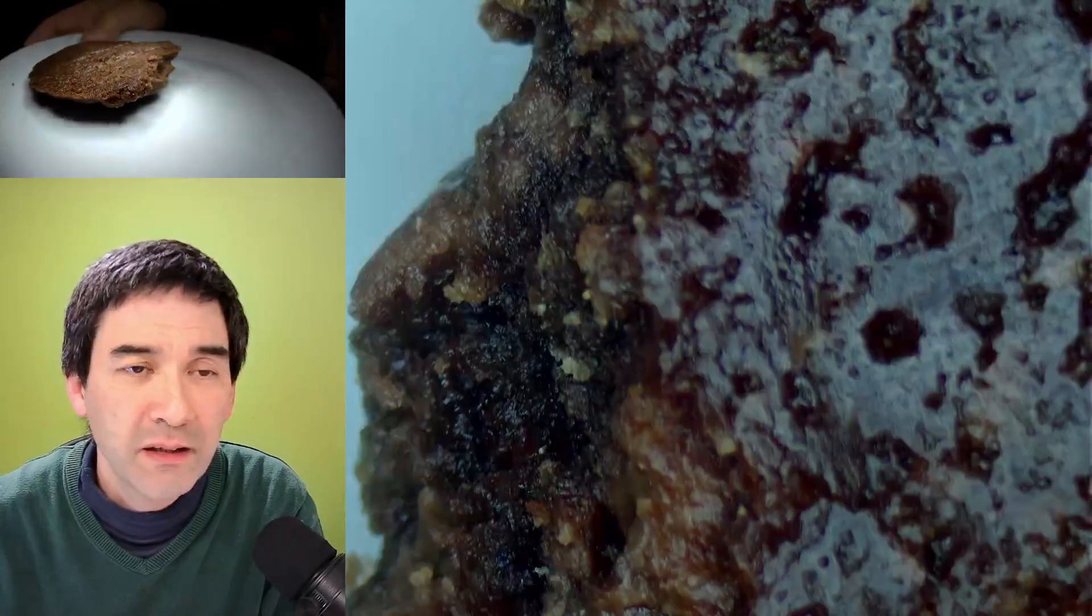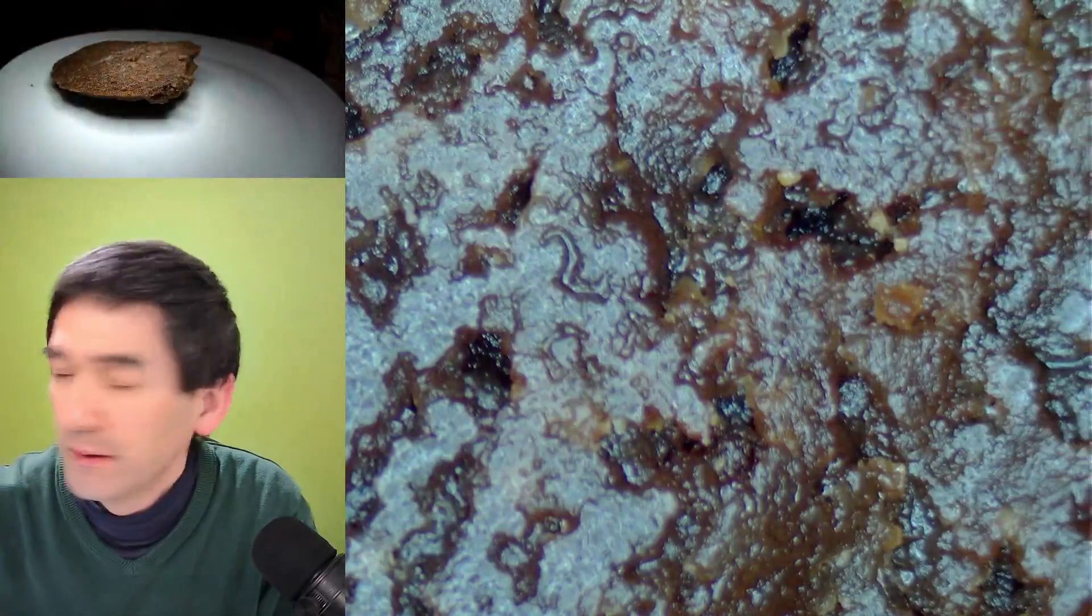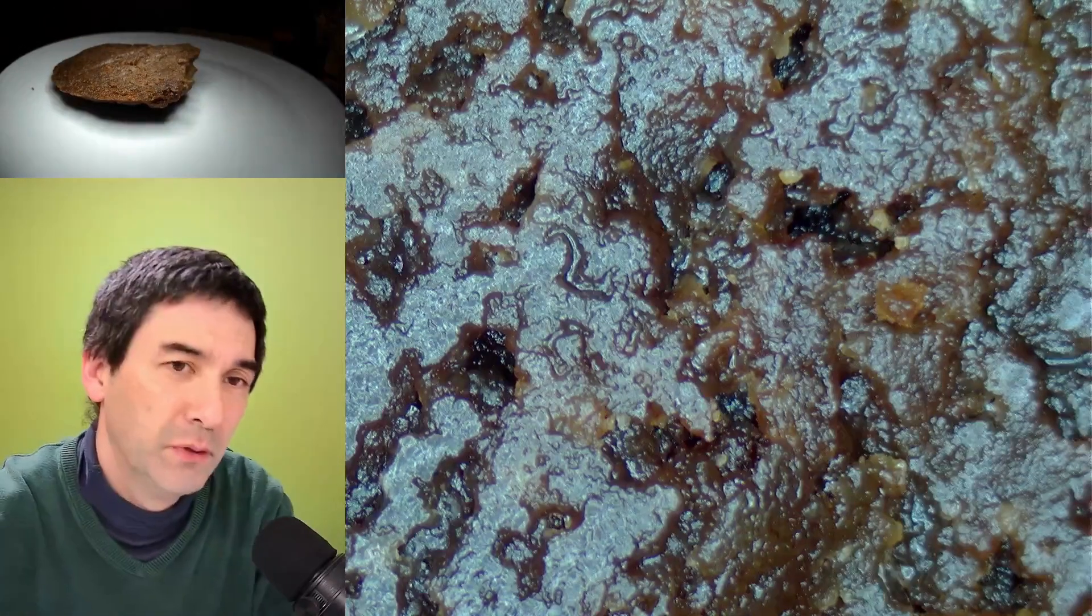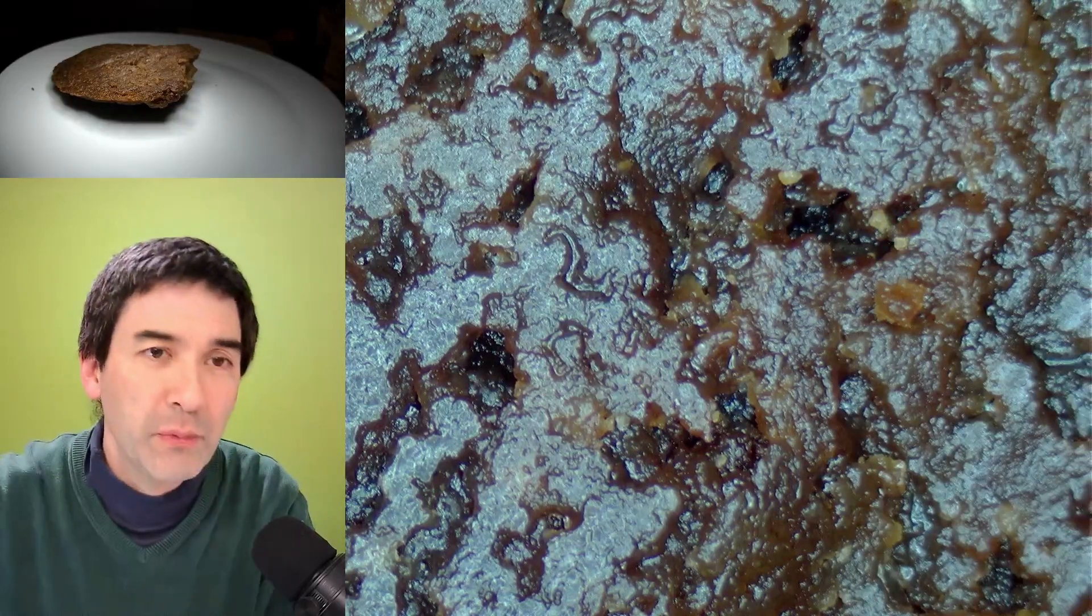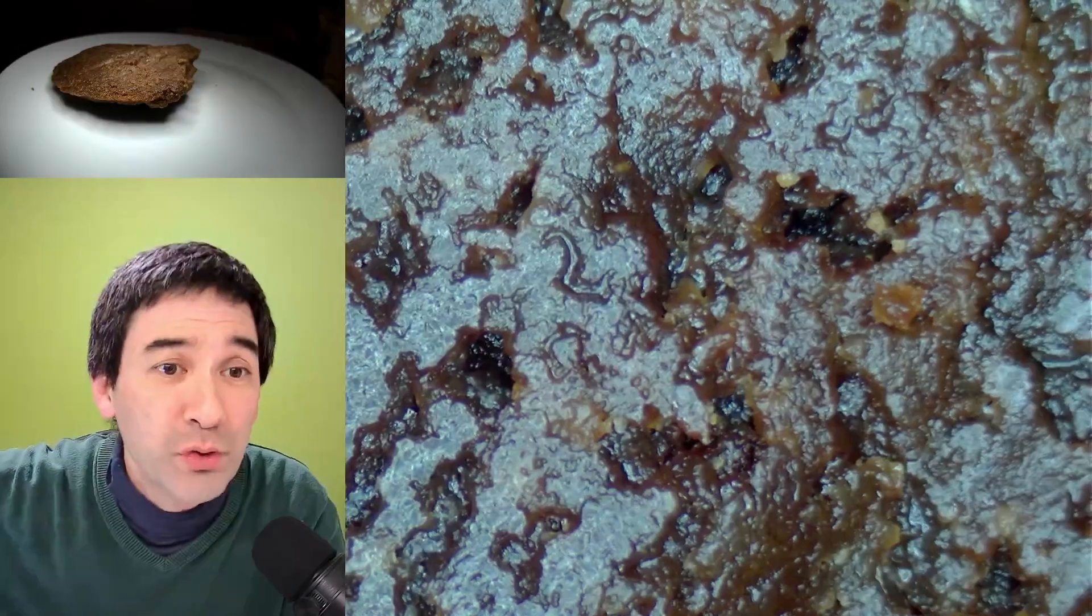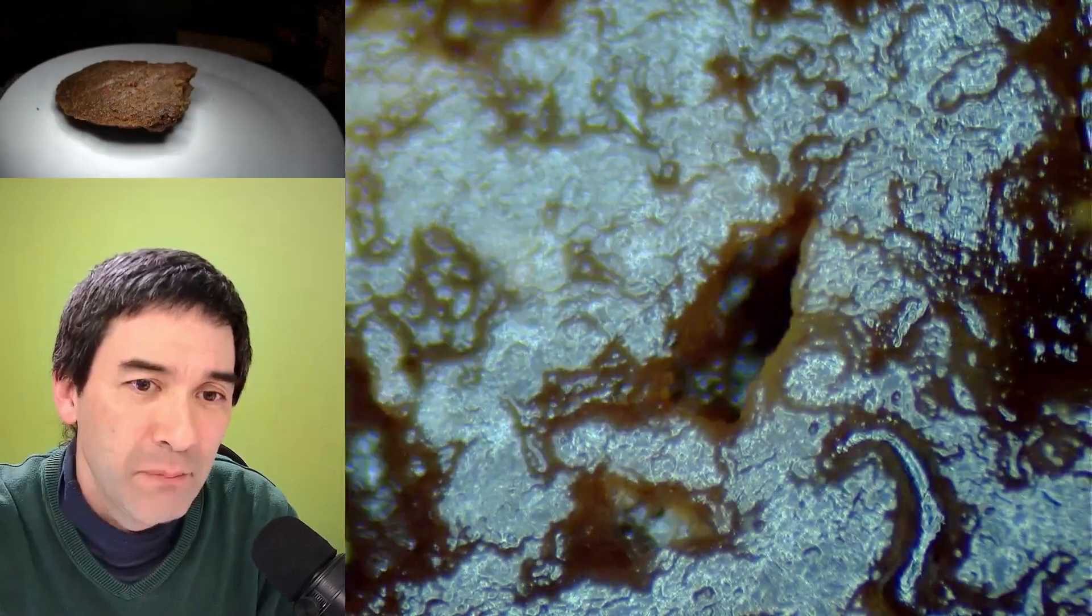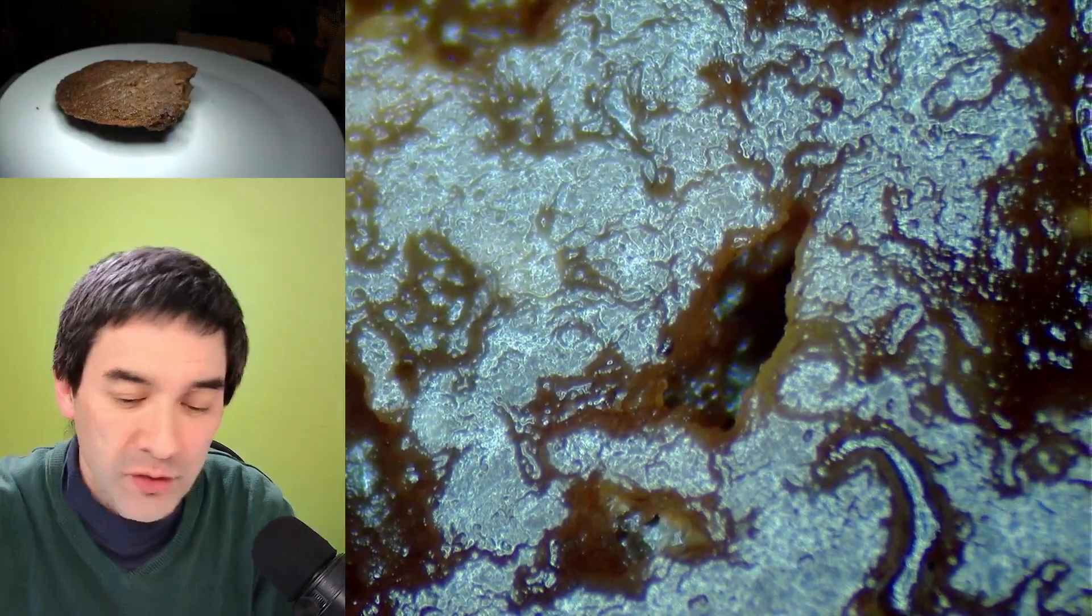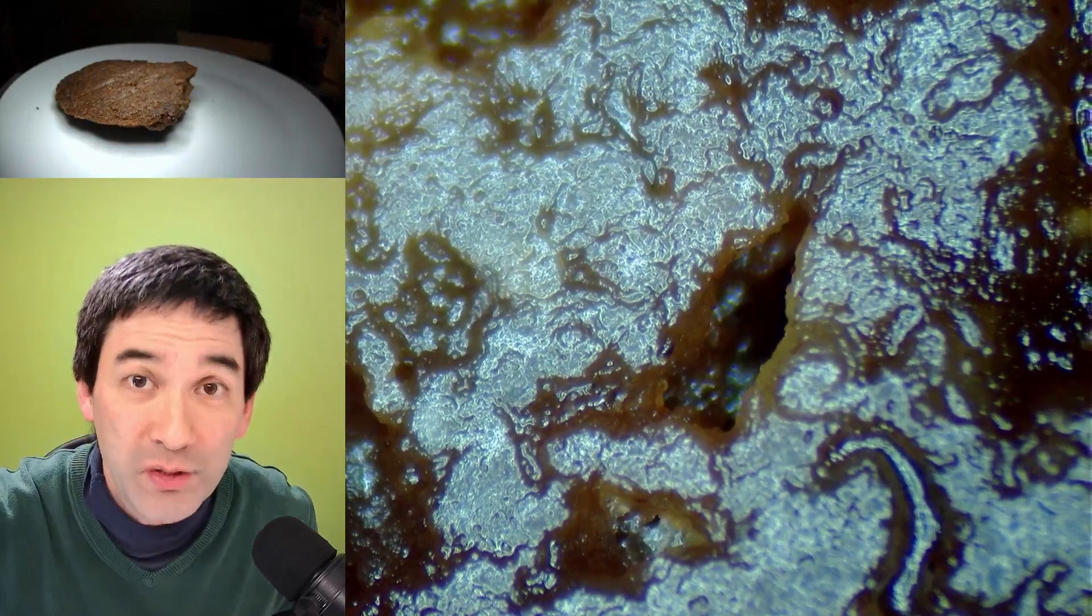That's basically the bottom side here. As you can see, looks pretty much very similar to when it's not magnified. Of course we can try to zoom in a little bit here. I'm kind of losing the focus every time when I zoom in. But that is basically the chocolate chip cookie. So now let's try the other one as well.